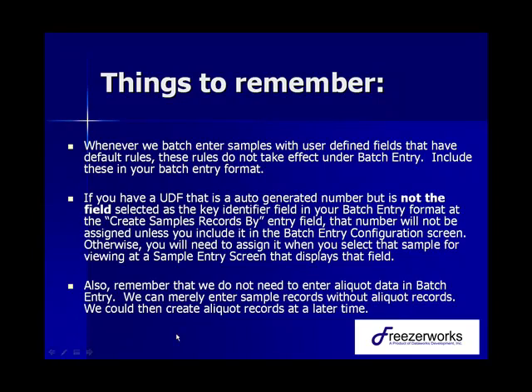Also, just remember that we don't have to enter aliquot data during batch entry. We can just create sample records and leave the aliquot field information tab screen blank. But if we do something like that, we could always create aliquot records at a later time.